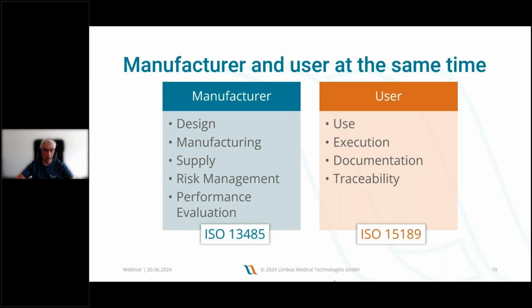Okay, I can see that responses are coming in, and so many of you obviously have not introduced 13485 or are not involved with that, but I can see that two of you, I'm closing the poll now, two of you have introduced 13485. This is impressive. Of course, we are working according to 13485, but this is quite a task to do in a laboratory where the focus is actually on the execution and not on design and manufacturing.